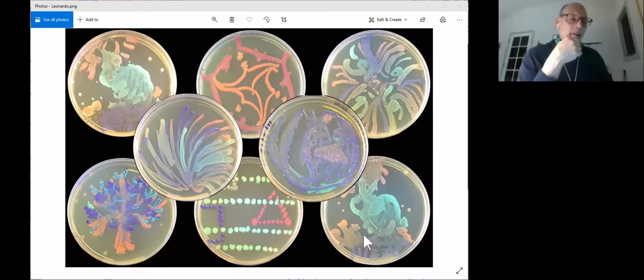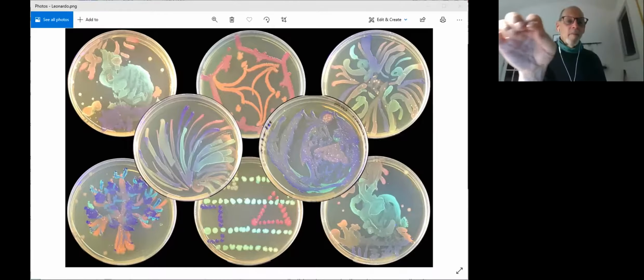And when I was watching Tim's presentation, the thought came up that you were doing sort of like biopixel art. Is it possible, instead of making pixels, to make the stuff bleed, using the robot? So you make it more blendy than pixely, is what I'm getting at. Yes, but it's hard to do reproducibly.